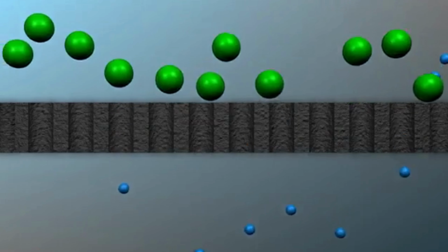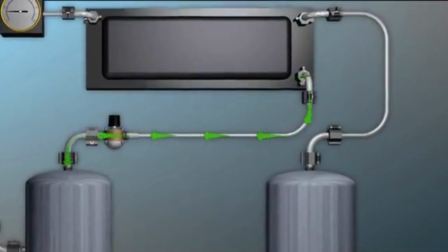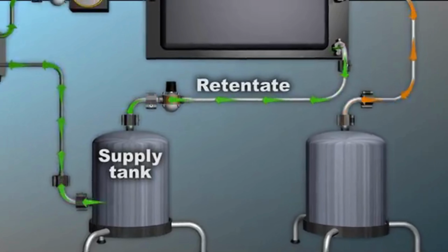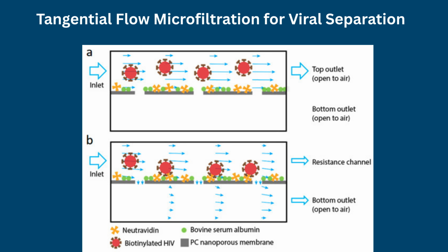Vaccine manufacturing extensively relies on TFF for purification and concentration of viral particles while preserving biological activity. Similarly, gene therapy production uses TFF for processing adeno-associated virus, AAV, vectors, and other viral delivery systems. In cell therapy and regenerative medicine, TFF facilitates gentle processing of cells and extracellular vesicles under sterile and closed system conditions.